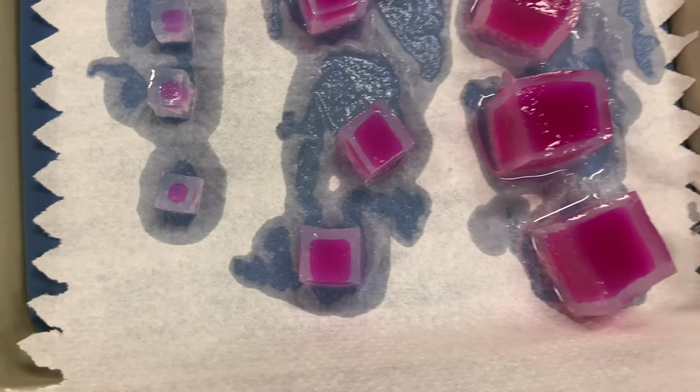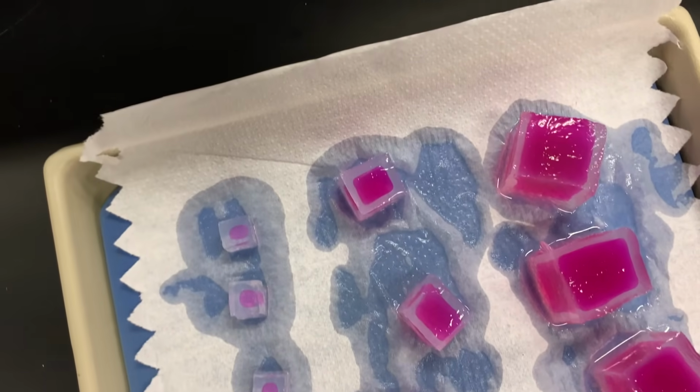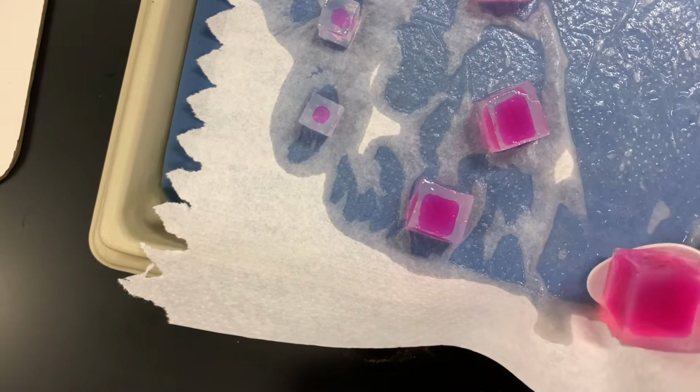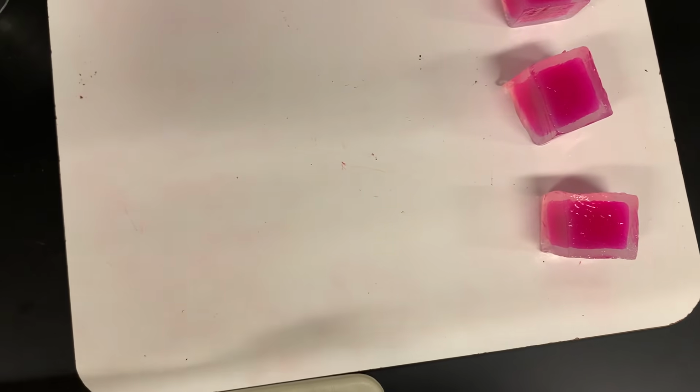I got a little old whiteboard here, and I'm going to transfer them to that. Whenever I transfer them, we should be able to see the pink a little bit better. All right, so I'm going to put them on here. Okay. All right, and you guys can see, with the white background, you can see what part is pink a little bit better.